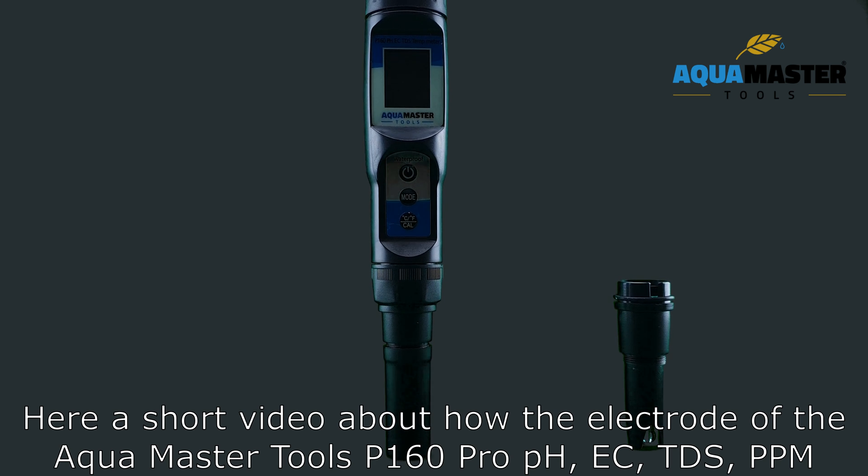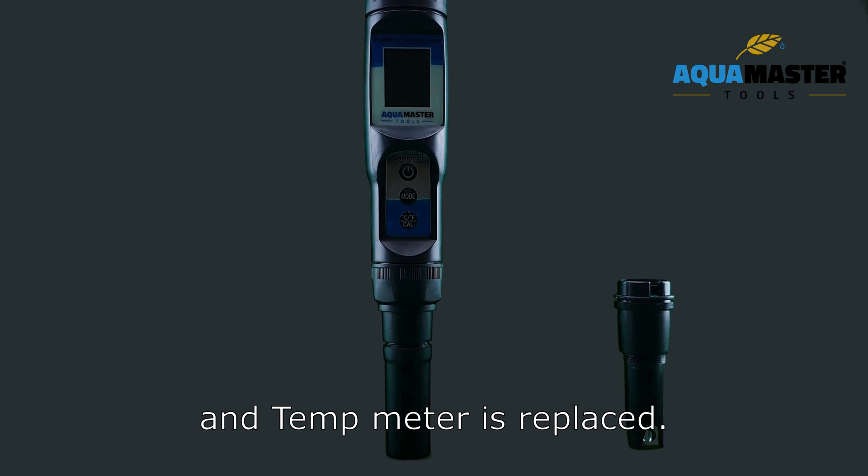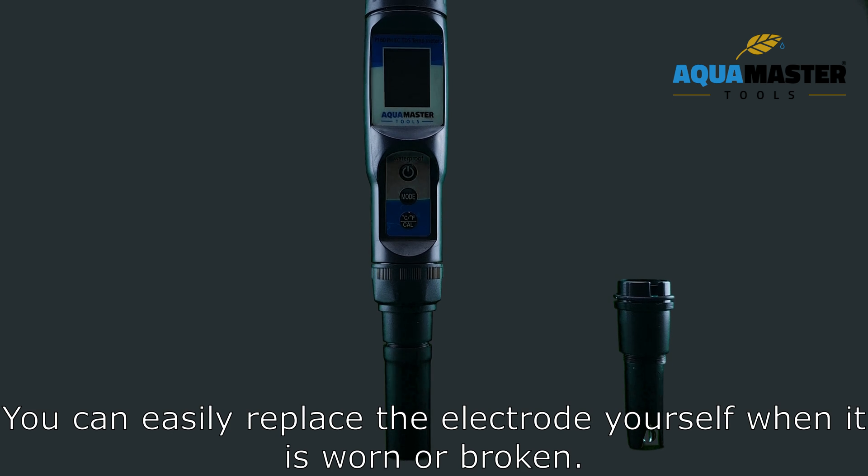Here is a short video about how the electrode of the Aquamaster Tools P160 Pro pH, EC, TDS, PPM and Temp meter is replaced. You can easily replace the electrode yourself when it's worn or broken.